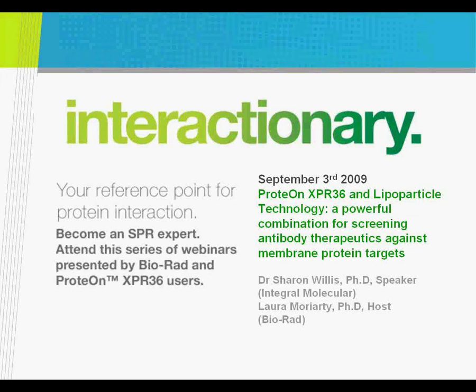So what happens is you immobilize your protein, or your peptide, and in the process you may denature it partially. If you denature it, then you're selecting antibodies that bind to regions that are not seen in solution, that are not seen in SPR.